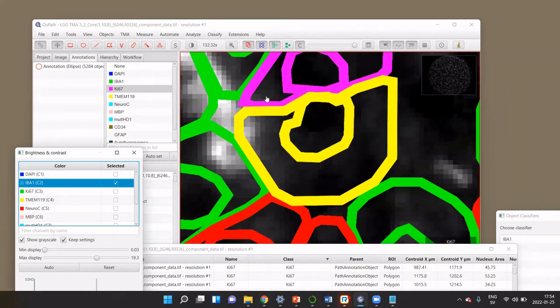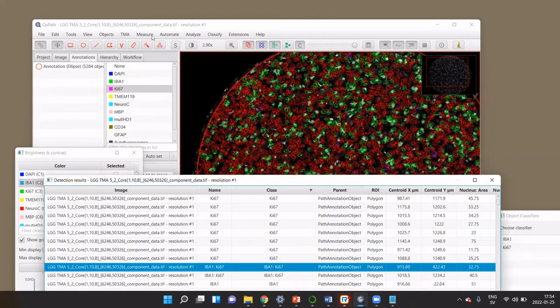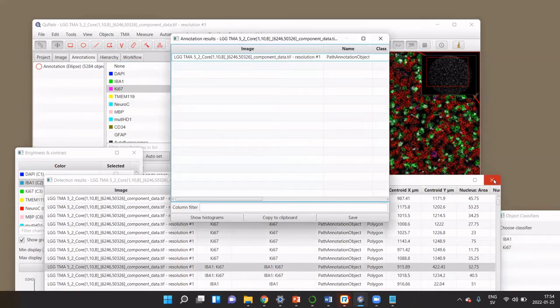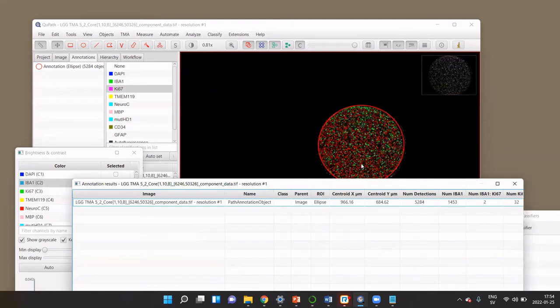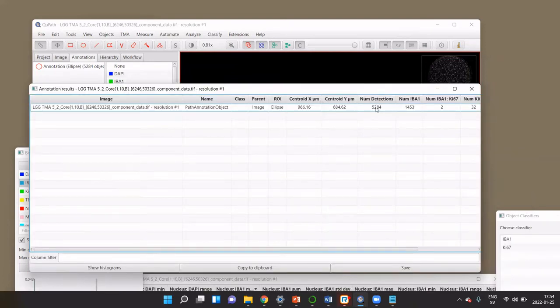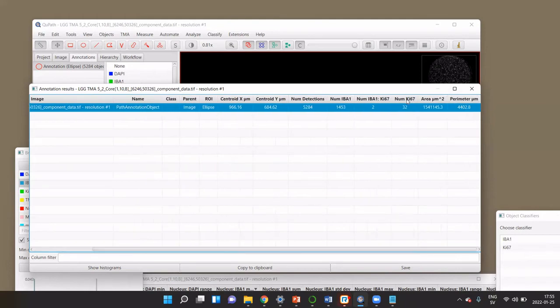Looking at the IBA1 signal for these supposedly double positive cells, they are probably not actually IBA1 positive — so this is a misclassification. One way to deal with it would be to set the threshold higher, or during cell detection to not expand cells as much as five microns since that may not reflect the cells well. Looking at the Annotation Measurements, we can see a nice summary: 5,284 cells detected, of which 1,453 are IBA1 positive, 2 are double positive, and 32 are classified as KI67 positive.